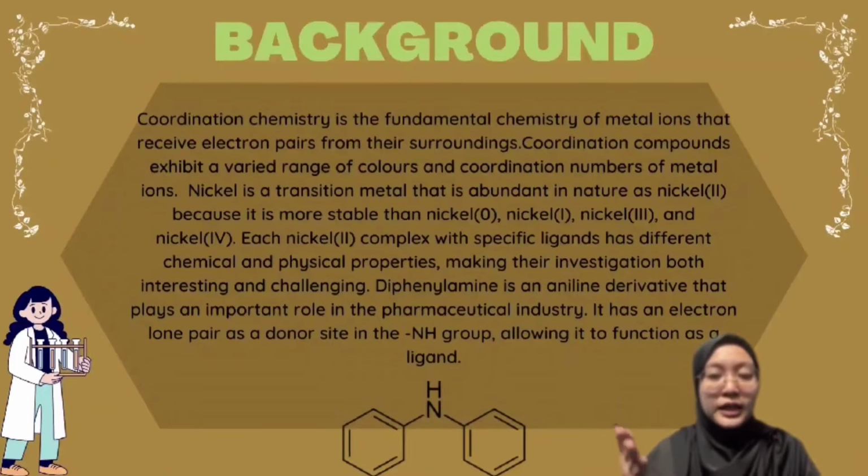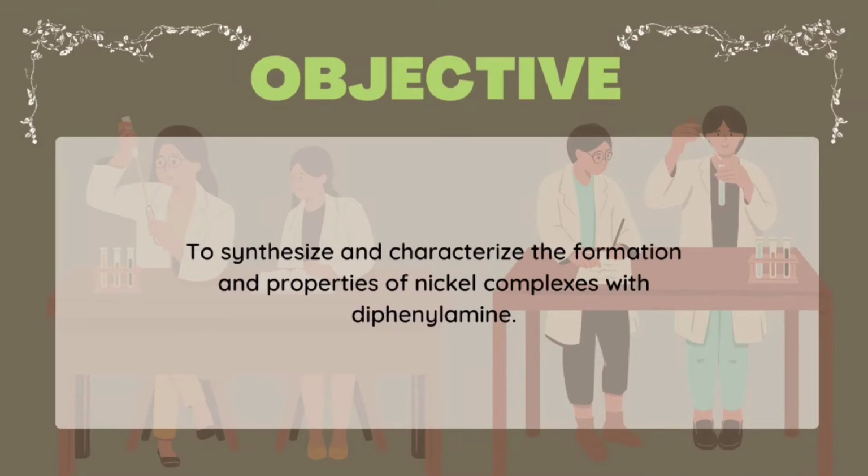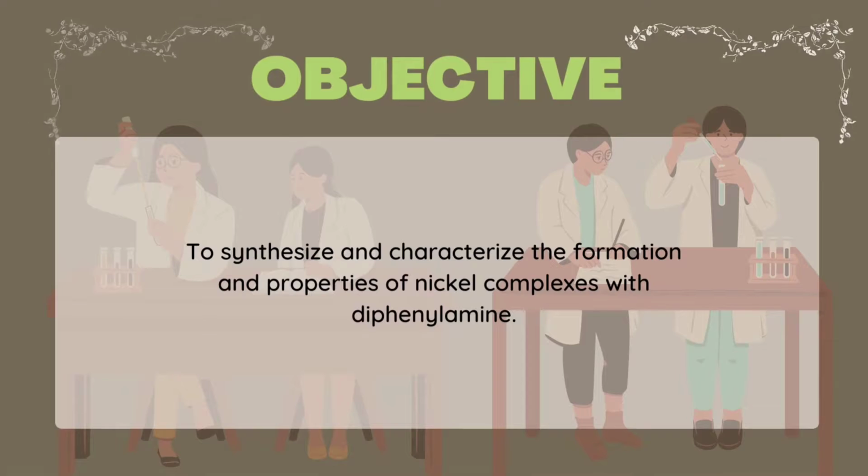Diphenylamine is an aniline derivative that plays an important role in the pharmaceutical industry. It has an electron lone pair as a donor site in the NH group, allowing it to function as a ligand. The objective of this experiment is to synthesize and characterize the formation and properties of nickel complexes with diphenylamine.